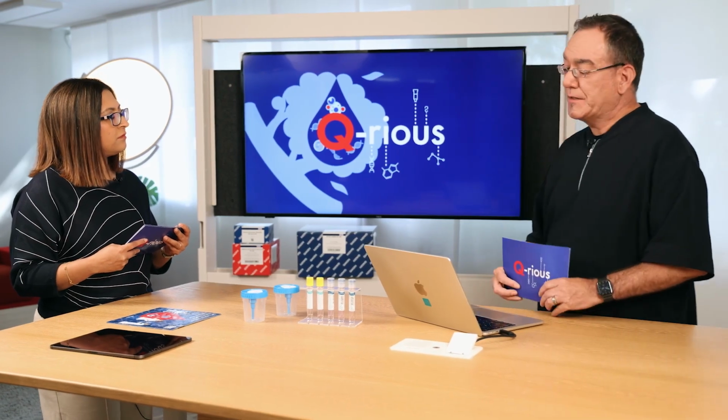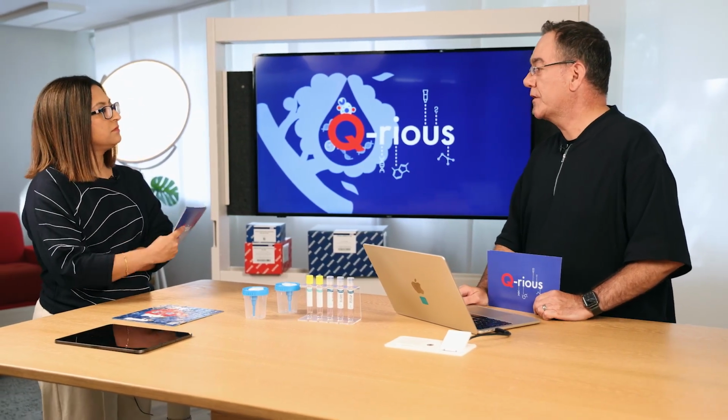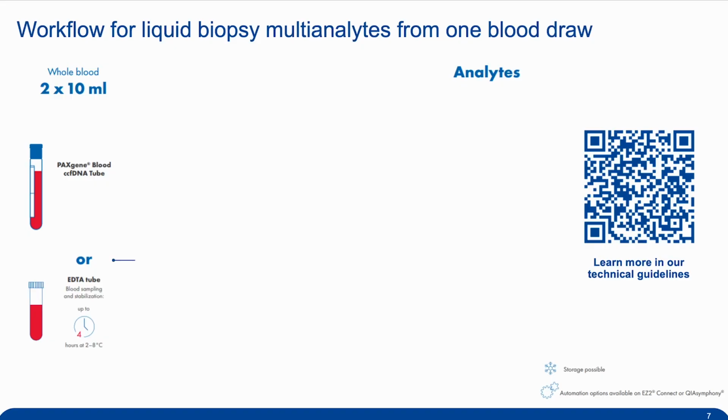And that's why it's so important to really try to combine all these things in a workflow. We have teamed up to develop a standardized workflow to actually do all these analyses without wasting any of these analytes. So we started with two PAX-gene blood cfDNA tubes, and we're first of all isolating the circulating tumor cells with the AdnaTest CTC Select method. And then we were isolating the RNA and the DNA out of these cells with the AllPrep Nano kit.